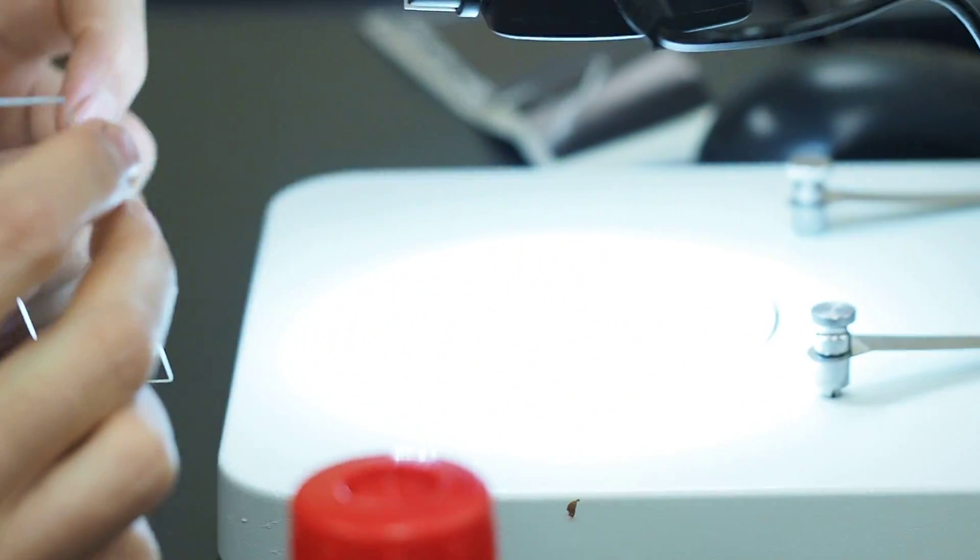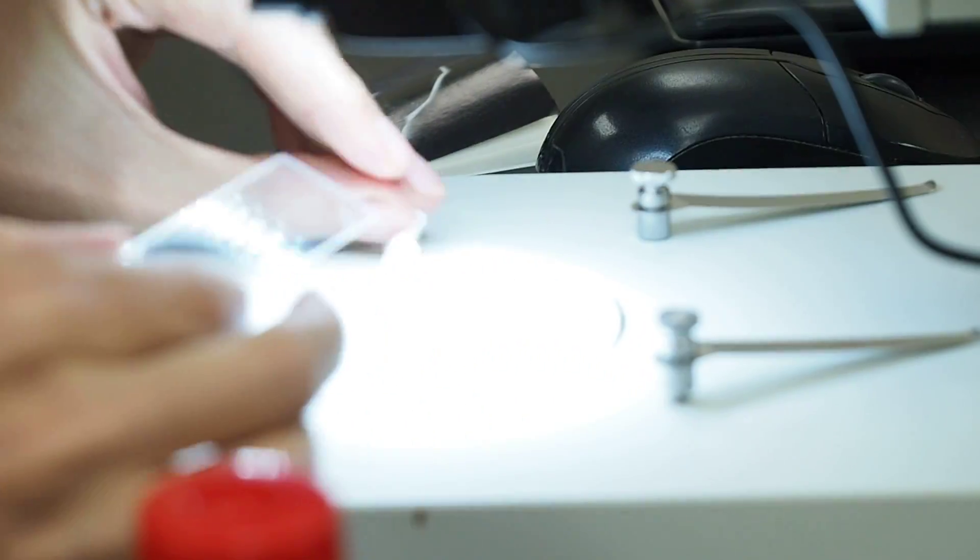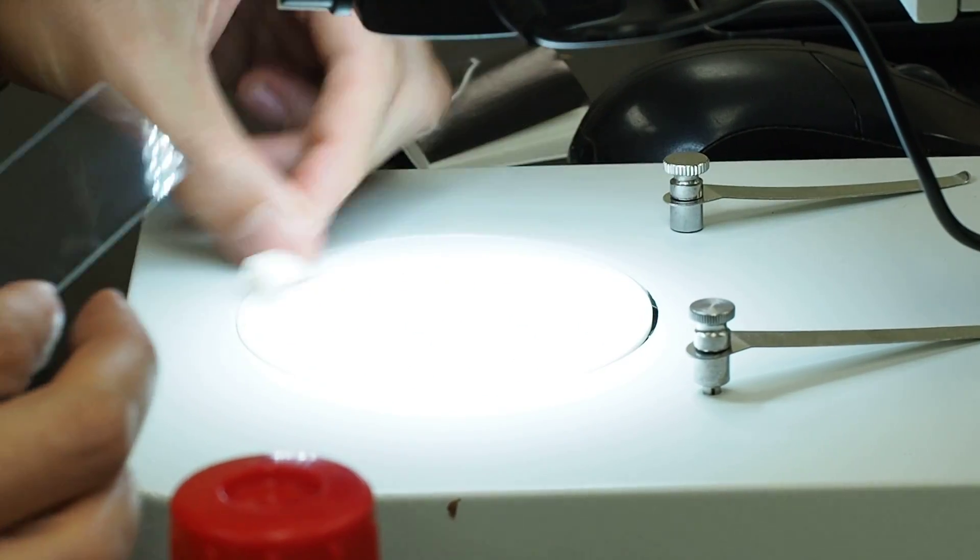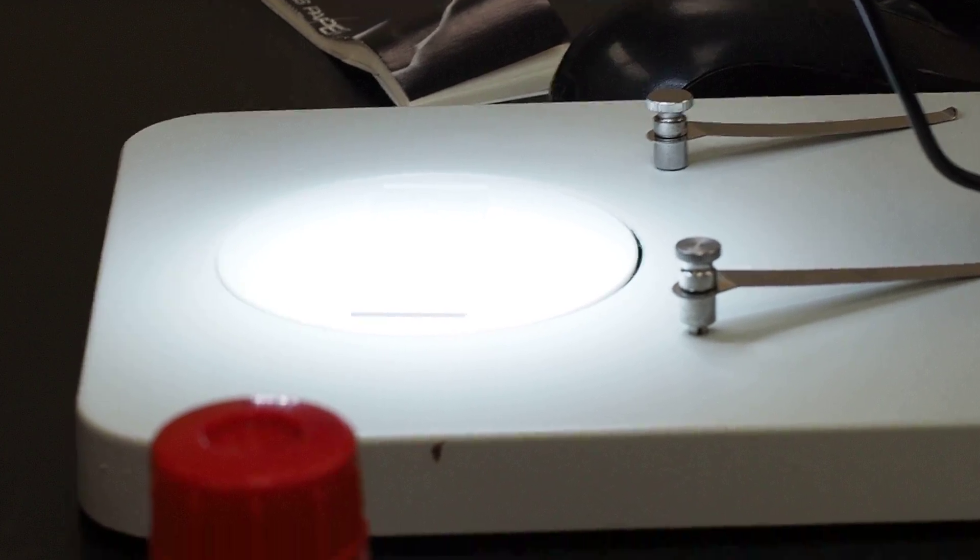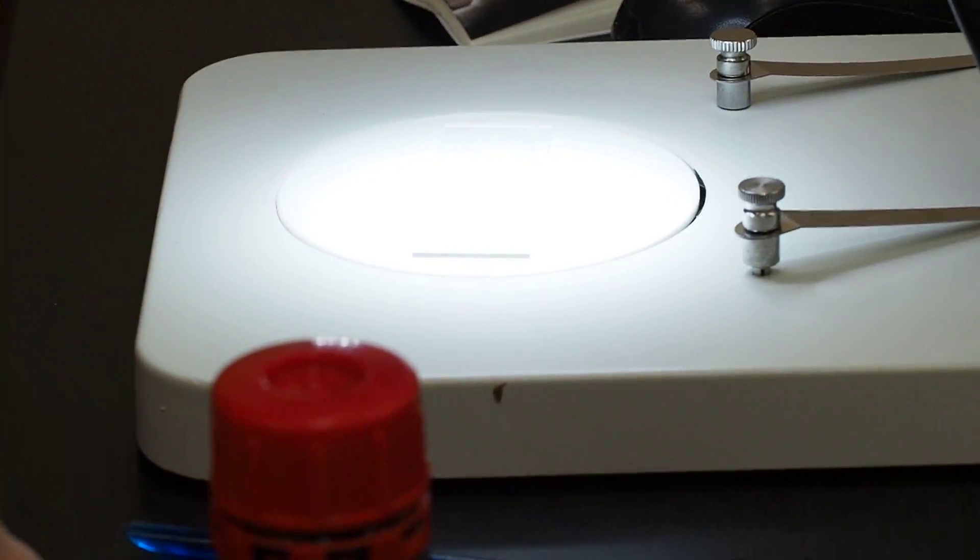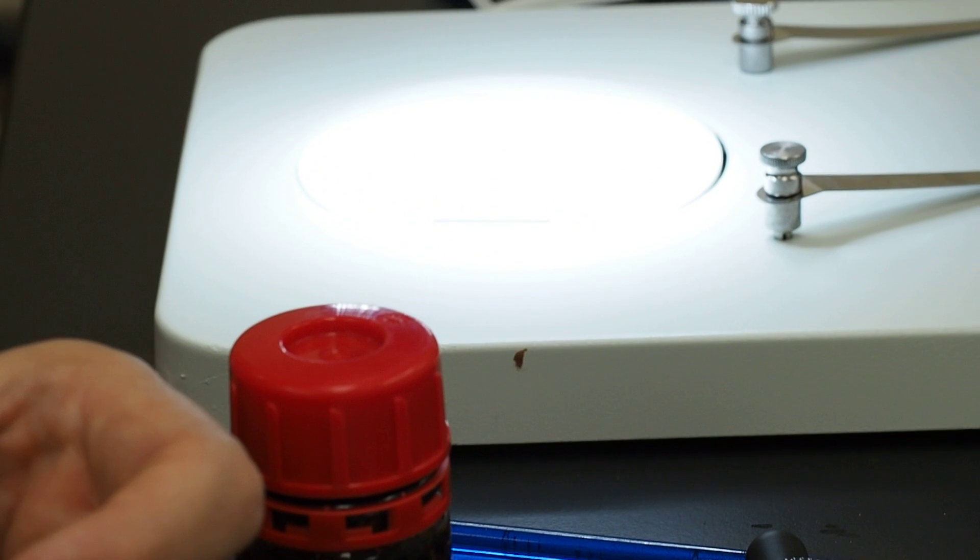So that one is ready. And then we have our cover slips. I like to use the round ones. Square, it doesn't really matter.